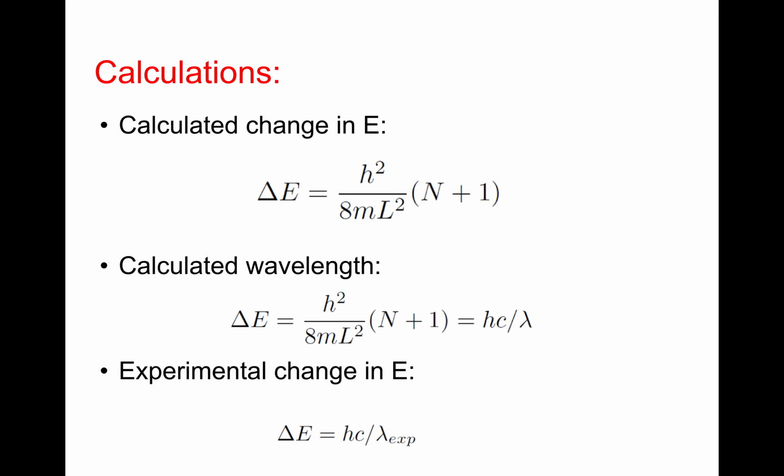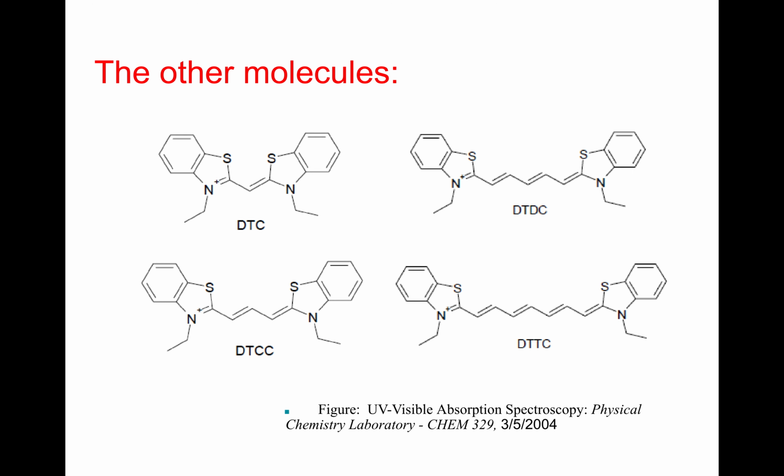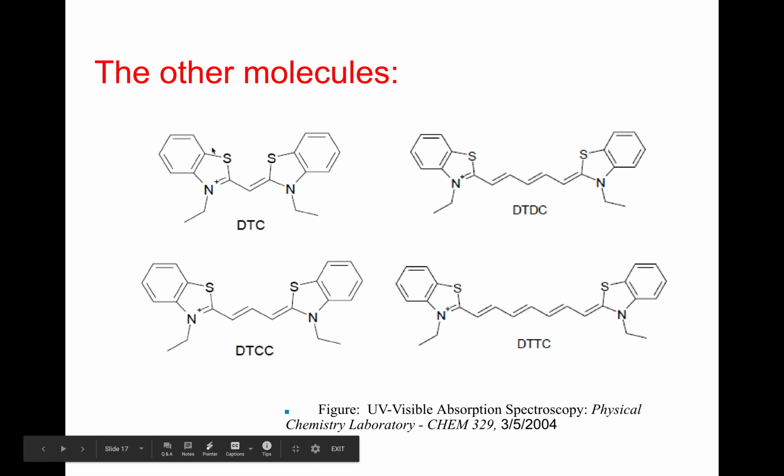So now, this is a good time to talk about this. This model for this system will perform poorly. You'll get errors around 20 to 40%, okay? So why is that? Let's go back here, okay? So I just went back one slide.